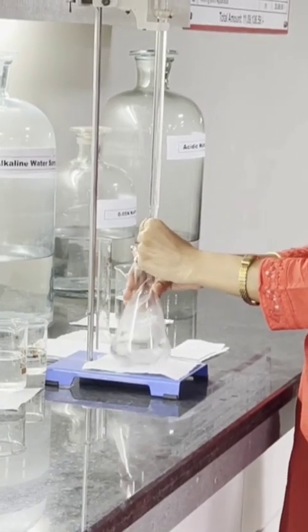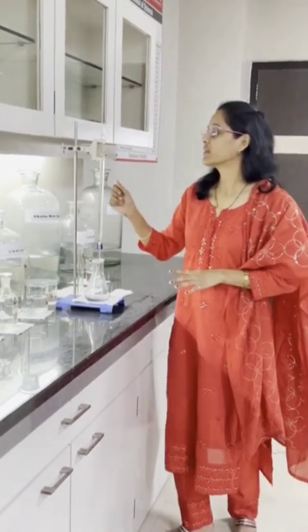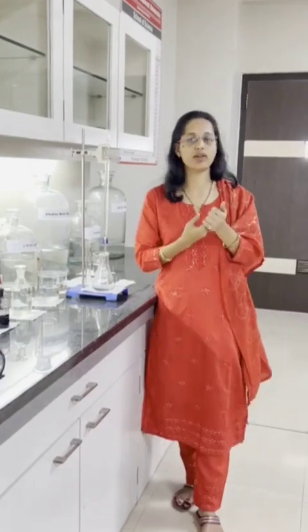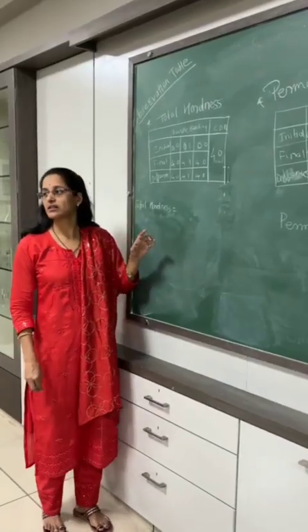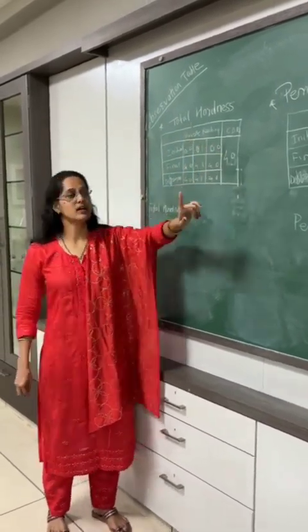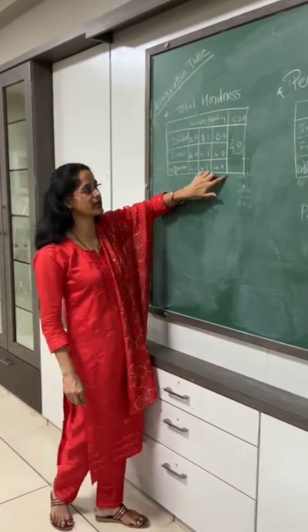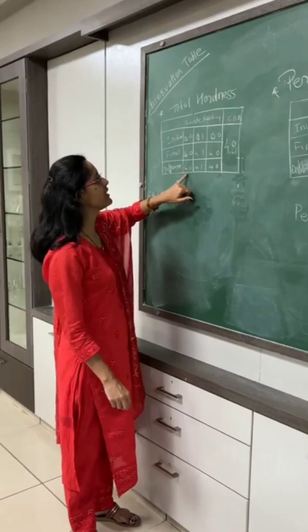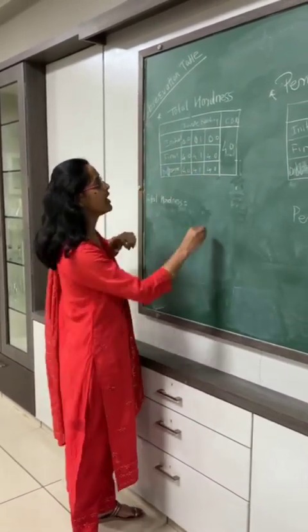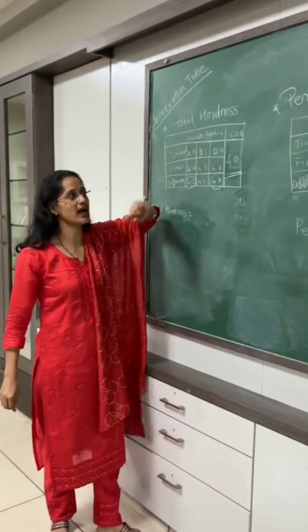This is the end point — you can see the sky blue color. The reading is 3.5. Now, this is the observation for total hardness — we have carried out the practical and we are getting 3 readings: first is 4.0, second is 4.1, and third is 4.0. As we are getting 2 constant readings, the CBR is 4.0 for total hardness.